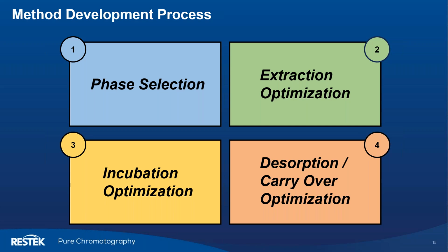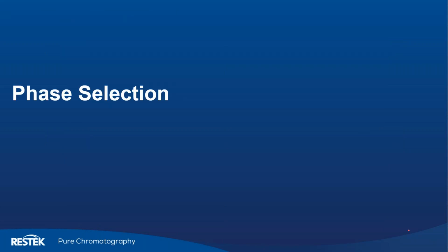But I think it's important to note that we should optimize our extraction time prior to incubation optimization, and that's just something that I've learned through building these different methods, which I think could really help you all as you maybe dive into developing some of your own SPME methods. So first we'll get into phase selection.